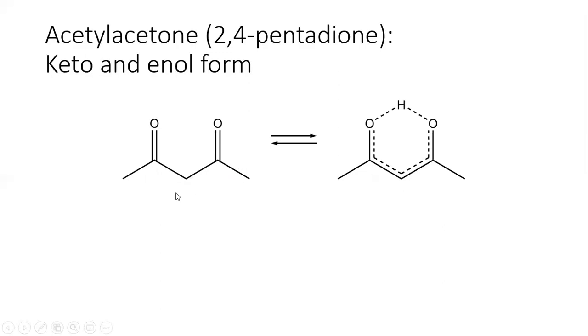This is more complicated for acetylacetone and its various derivatives because in the NMR spectrum you will see peaks coming from the keto form and the enol form all together, because they exist in equilibrium. Before we get into the gory details, let us first identify the groups of protons for the keto form, and then we'll go to the enol form.